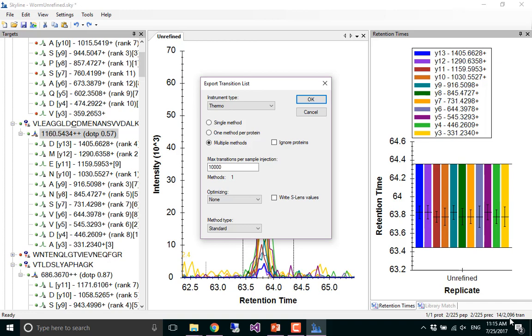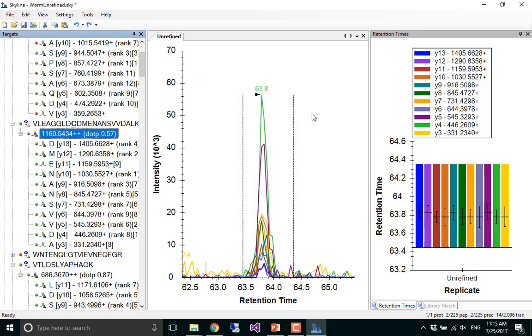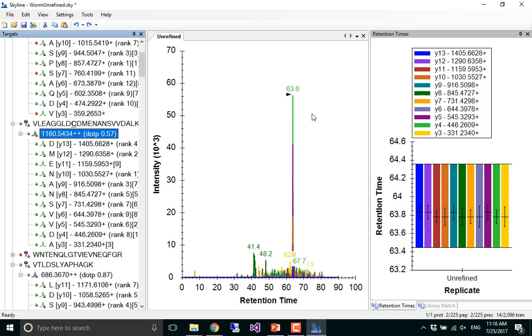Think of this. This is our exhaustive method, and you can see that. Actually, I should show this. Cancel. So, is everybody looking at the peak zoomed in, like this, or are some people looking at it zoomed out? Zoomed out. Okay. So the most important keyboard command in Skyline, I think, is F11 and Shift F11. So if you're looking at it zoomed in like me, press Shift F11, and now you're zoomed out. And who can tell me how long a gradient this was? Yeah, something 100, whatever, 120, 90.